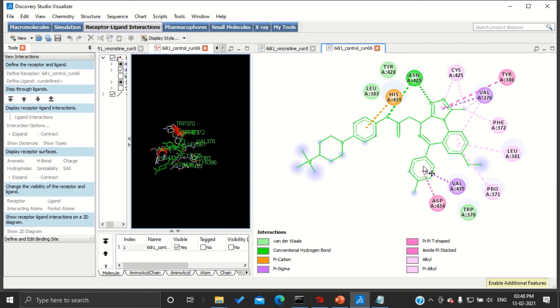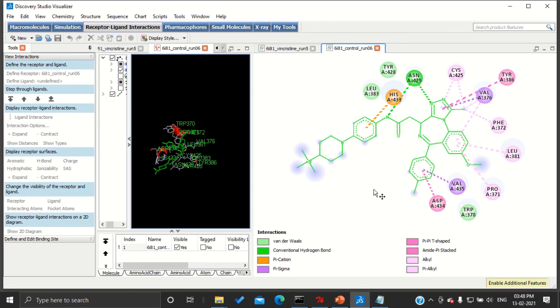Here I am showing the results of our control. Previously we have seen the results of our drug. By comparing these two with the help of the least binding energies, or the amino acids to which it was binding, the type of interactions, and the number of interactions, we can come to a conclusion.